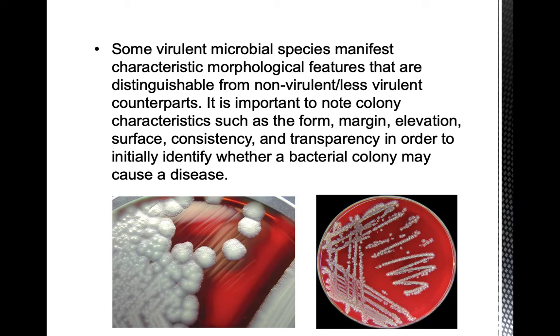So this is blood agar, and the species growing in them are different. For this picture, this is a colony of Bacillus anthracis, which is a causative agent of anthrax. So you see how the colony looks. Later, once I have introduced how we can characterize them, you might want to go back to this slide and try to describe the appearance of the Bacillus anthracis colony.